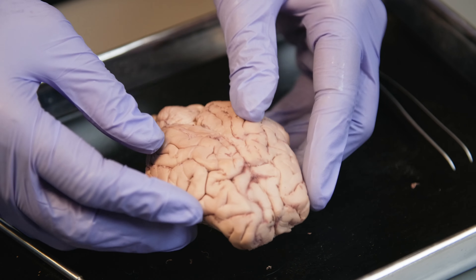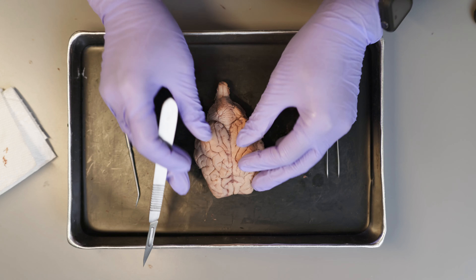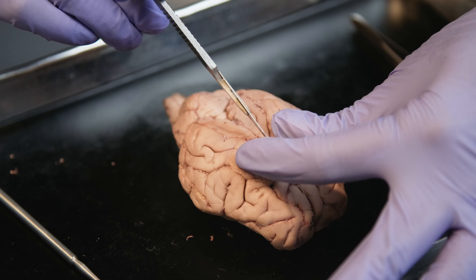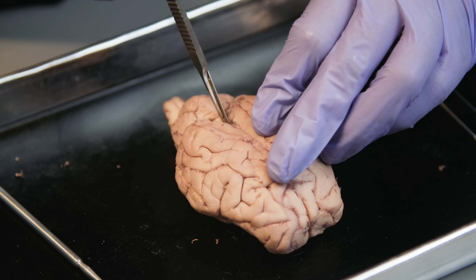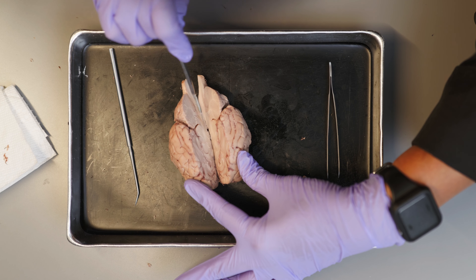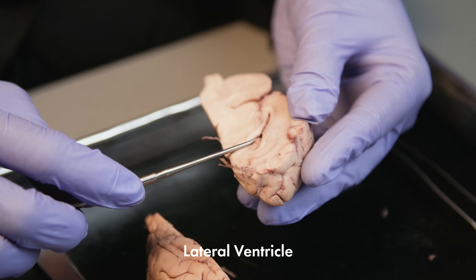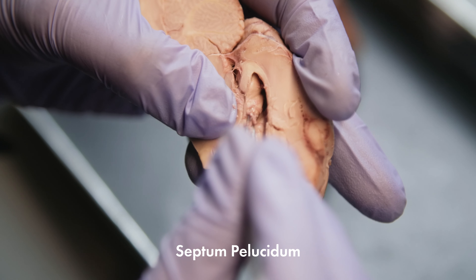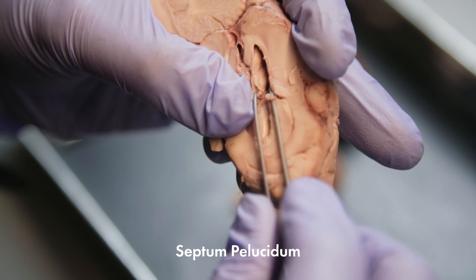Next, let's look at the inside part of the brain, so we are going to cut it in half. We are going to put the brain on the tray with the dorsal side facing up. We will use our fingers to part or widen the medial longitudinal fissure. I will insert the scalpel into the fissure and cut through the corpus callosum connecting the two cerebral hemispheres, then continue to cut dividing the cerebrum, cerebellum, and brain stem into two longitudinal halves. Each hemisphere contains a lateral ventricle, referred to as the first and second ventricles. The lateral ventricles can be located by removing the septum pellucidum.